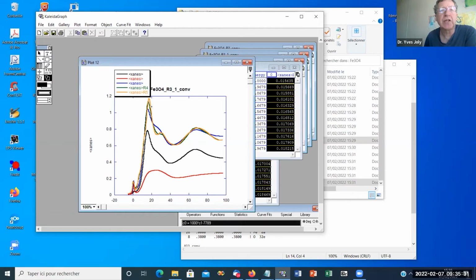And typically in iron, it's already not so bad here, but we could go a bit further, 6 or sometimes even 7. It would be the best. But anyway, there is not so much difference anymore from here. What you can note also is that the general shape of the signal, the one with a very small radius, was not exact, of course, but anyway, it's not completely bad.